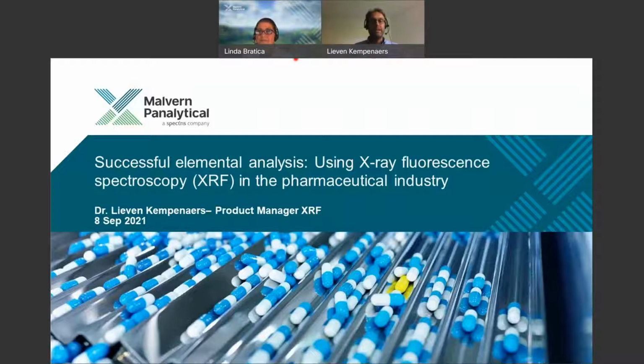It's a great pleasure for me to say something today about X-ray fluorescence spectroscopy, called XRF, for the pharmaceutical industry and mainly for specific pharmaceutical applications.